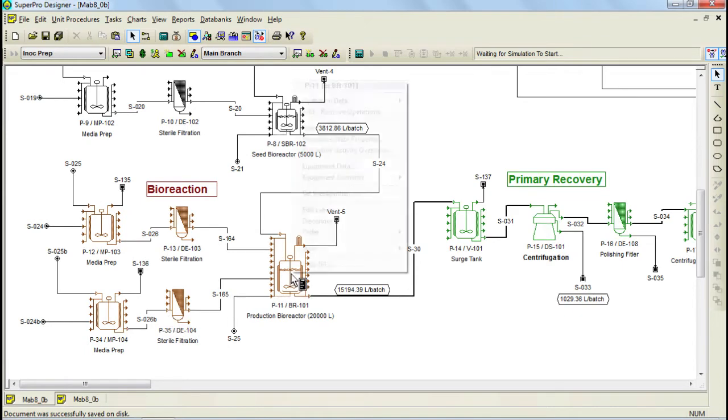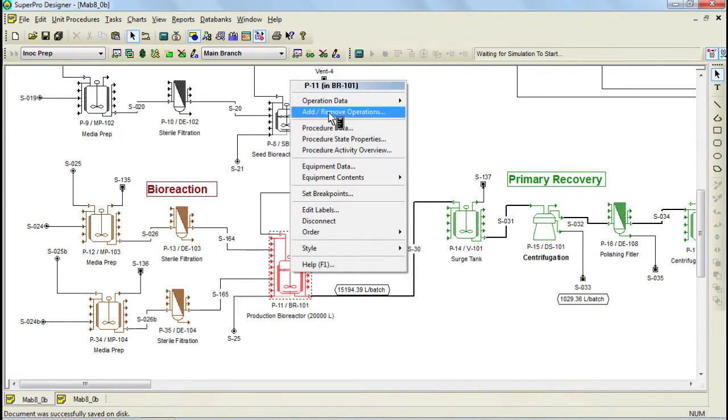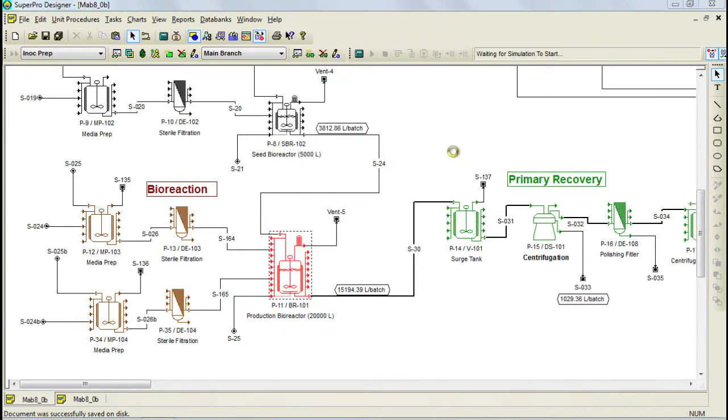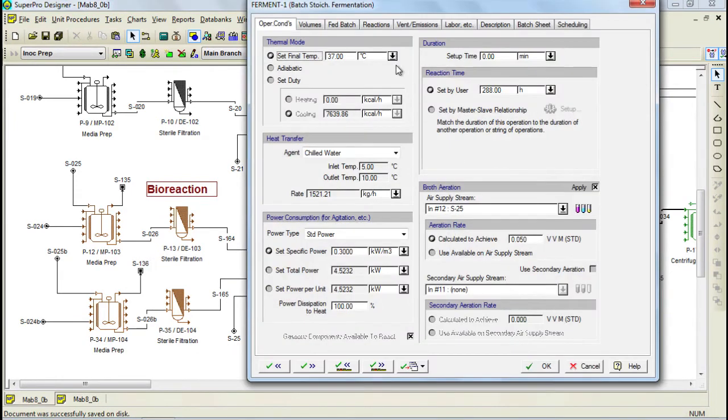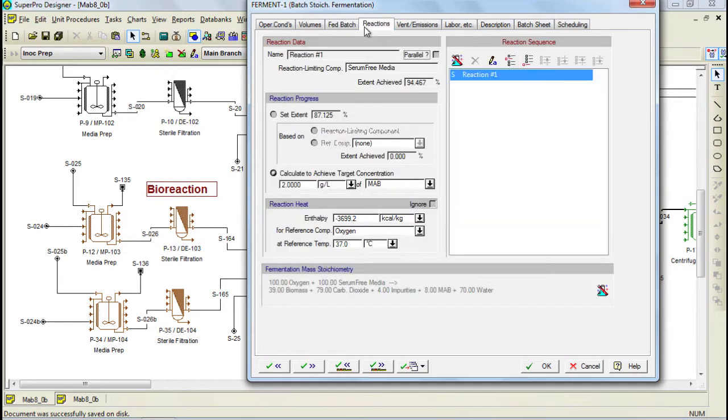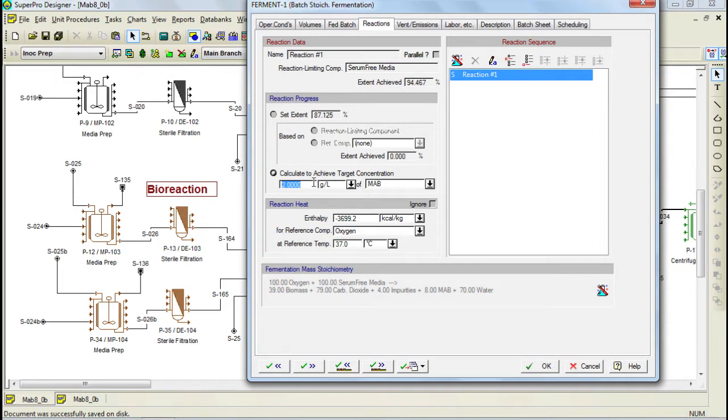The fed batch operation can be easily edited through the fermentation operation by selecting the fed batch tab. Through this tab, you can specify fed batch conditions. Furthermore, the fermentation is carried out for a period of 12 days and the target production titer can be specified through this tab. SuperProDesigner gives users the possibility to also enter kinetic parameters for this type of reactions.